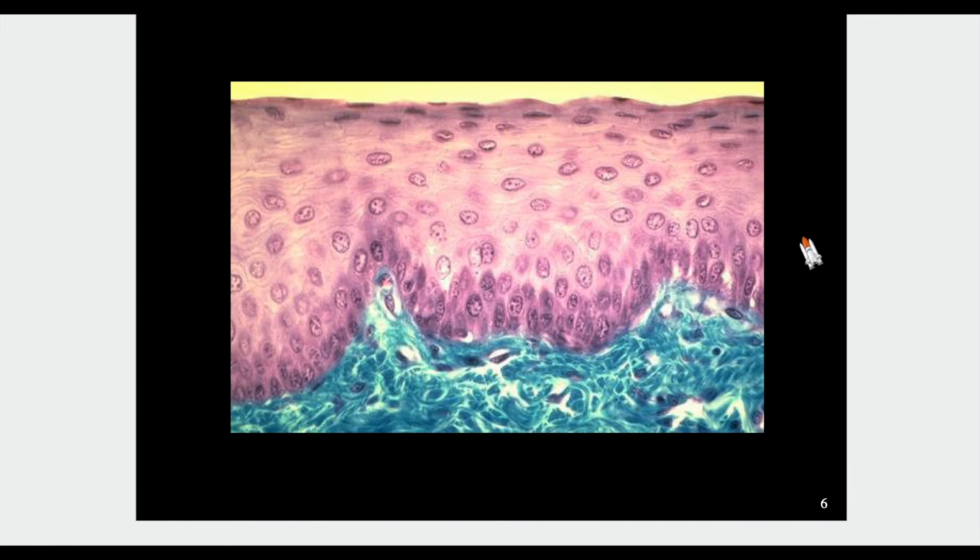Lastly, the other thing you'll want to study is that table we had towards the end of the lab manual. It asked you to be able to identify where we would find that tissue in the body. And that is important as well, because that goes along with the whole form follows function theme we have in A&P. So for instance, here we have the stratified squamous epithelium. Remember, stratified, many layers, squamous, those scaly shaped cells, and it's an epithelial tissue.